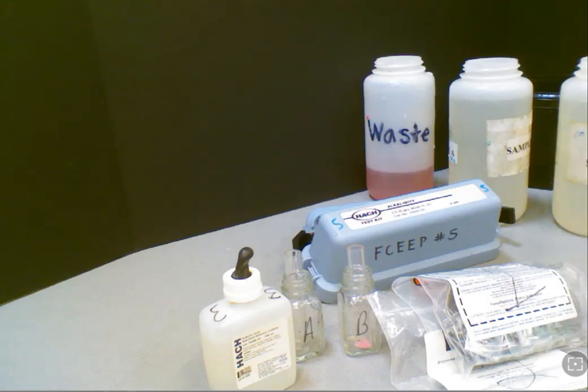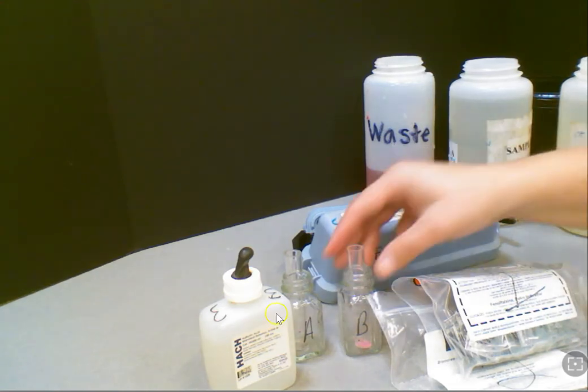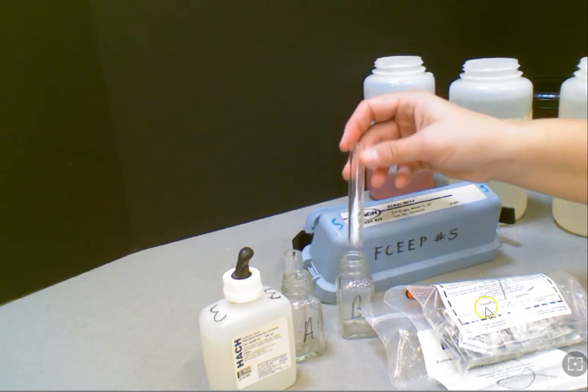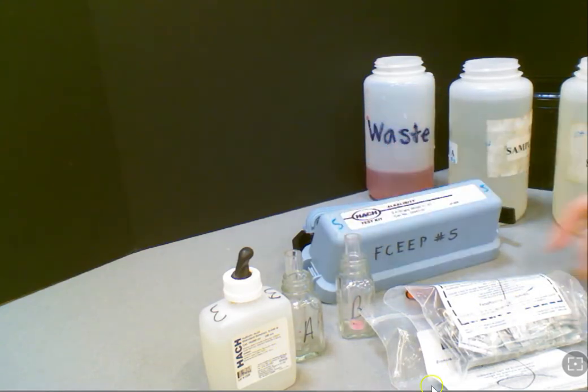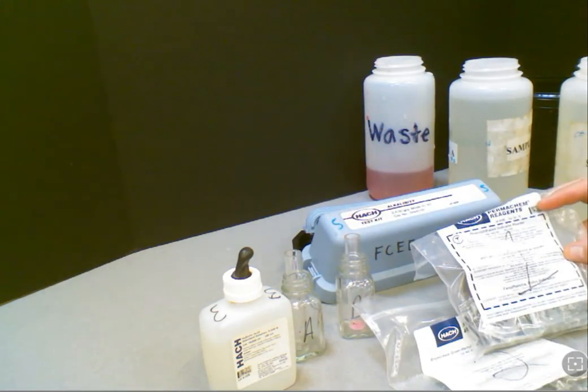So we're going to start with the alkalinity test now. When you unpack your materials, you'll notice you'll have some square mixing bottles, some test tubes for measuring, and you'll have three different chemicals here. We have them marked 1, 2, and 3, but as we get through the lab, we'll identify them as we use them.